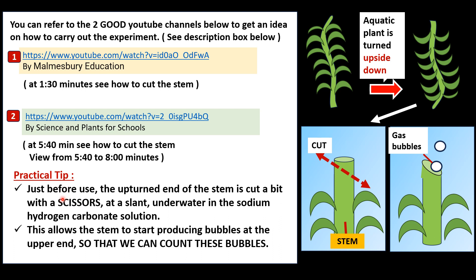Basically, just before you start doing the experiment, you place the hydrilla or elodea plant upside down in a boiling tube that already contains the sodium hydrogen carbonate solution. Put the plant upside down in the boiling tube. The end is usually not slanted, so you make a fresh cut using scissors inserted into the boiling tube and cut the end of the stem at a slant — underwater, inside the sodium hydrogen carbonate solution — which supplies carbon dioxide for photosynthesis.